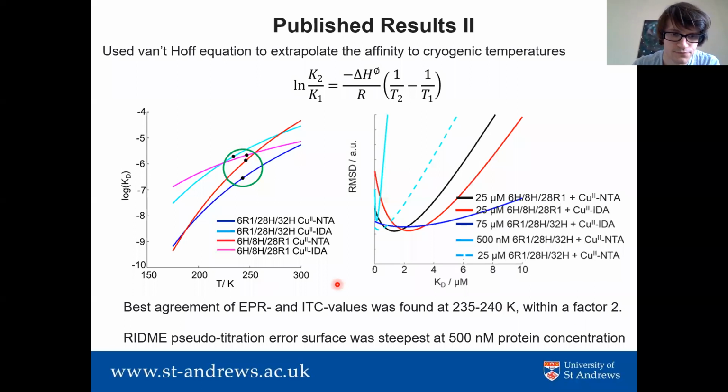And at this temperature, your cooling rate exceeds your translational and diffusional processes, which would otherwise contribute to your equilibrium, which at this temperature and below begin to freeze out. So that was quite nice, that we were able to reconcile these two approaches.